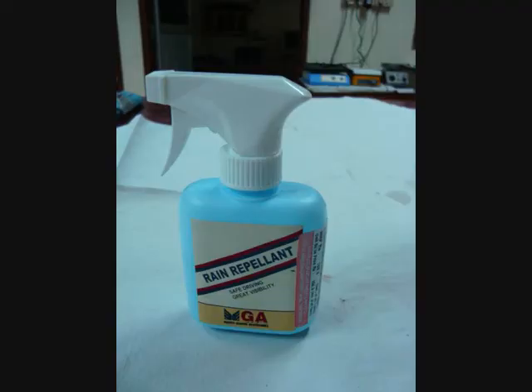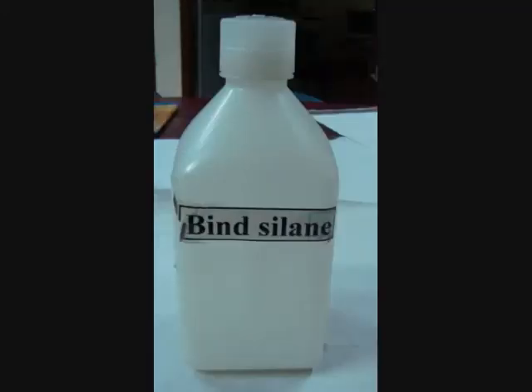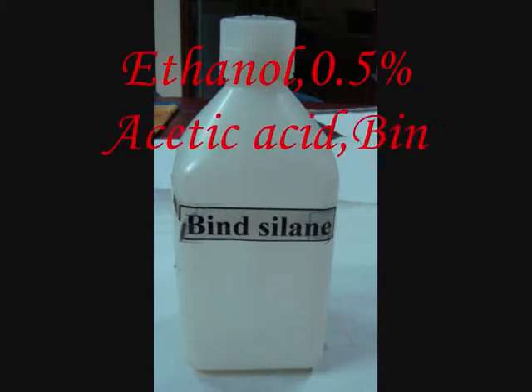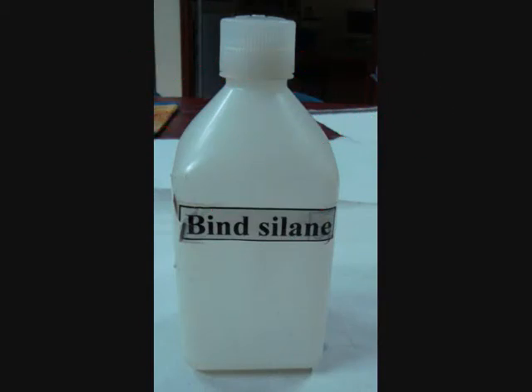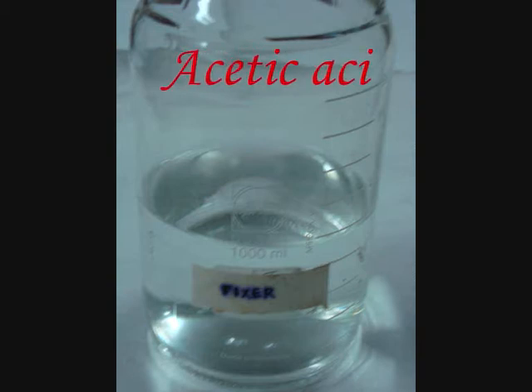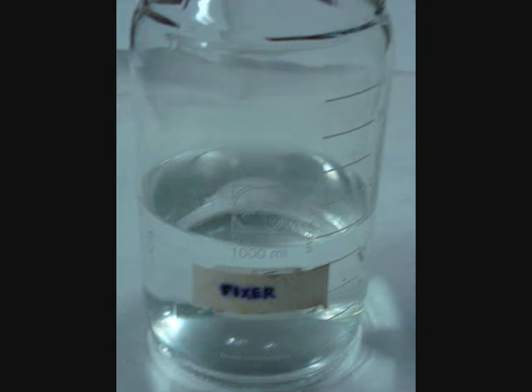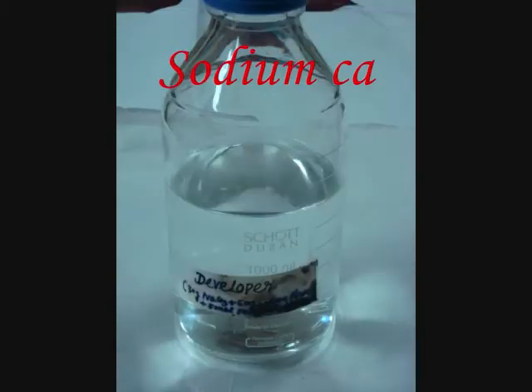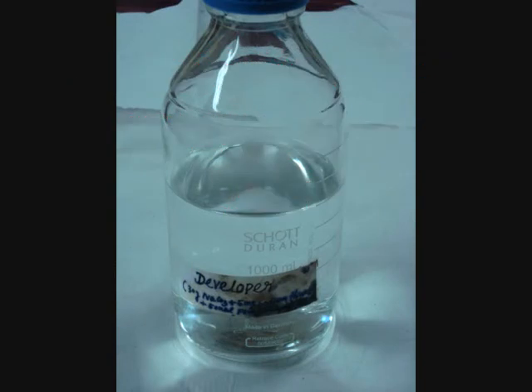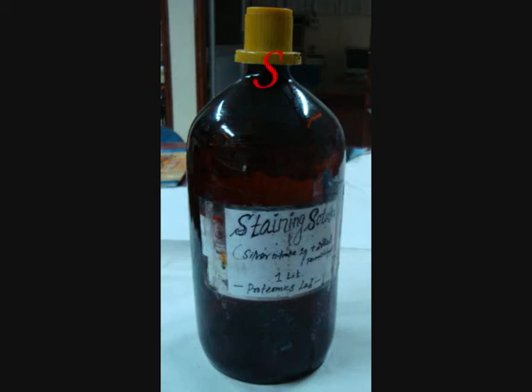Let's see the chemicals used. This is the rain repellent that is commercially available. Bind silane consists of ethanol, 0.5% acetic acid, and bind silane. APS and TEMED catalyze the polymerization. Fixer consists of acetic acid and water. Developer consists of sodium carbonate, formaldehyde, and STS. Stainer consists of silver nitrate and water.